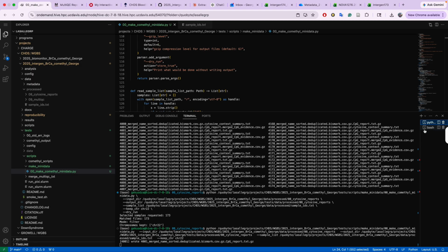Okay, all right. So basically, one file has been done out of the 173. Yeah. So it might take some time for it to completely finish doing everything.